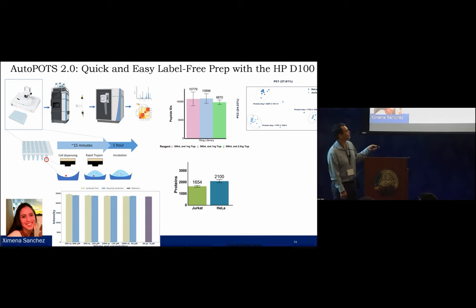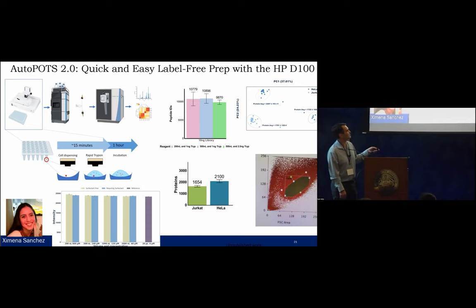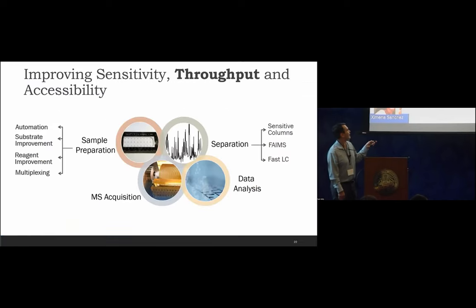And so that was kind of weird, but we did some FACS sorting of the same population and the FACS technician was like, oh yeah, you do have two cell populations, so that may make sense. And so these are bigger, these are smaller, about 2,300 proteins on average here versus about 1,700 proteins on average there. So anyway, we don't really know. This is all very preliminary, but I think it's nice in terms of accessibility.